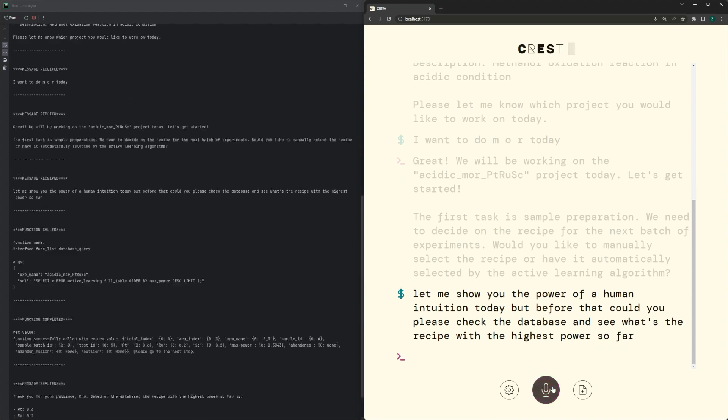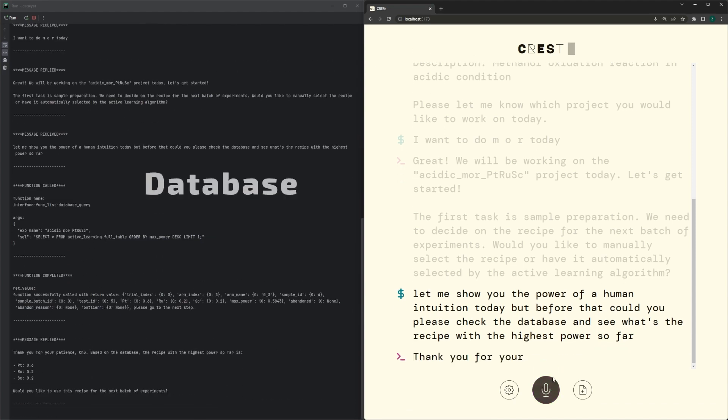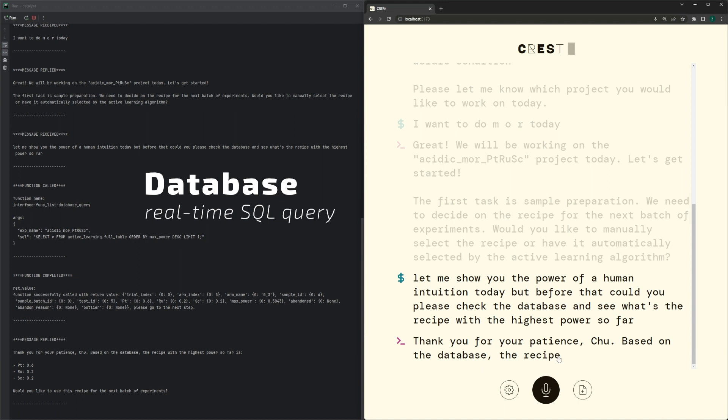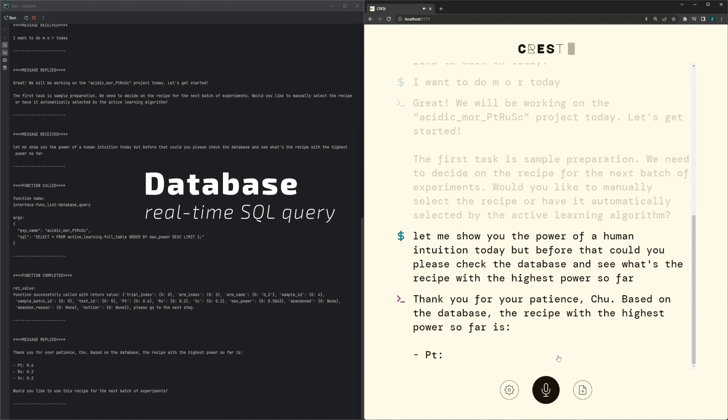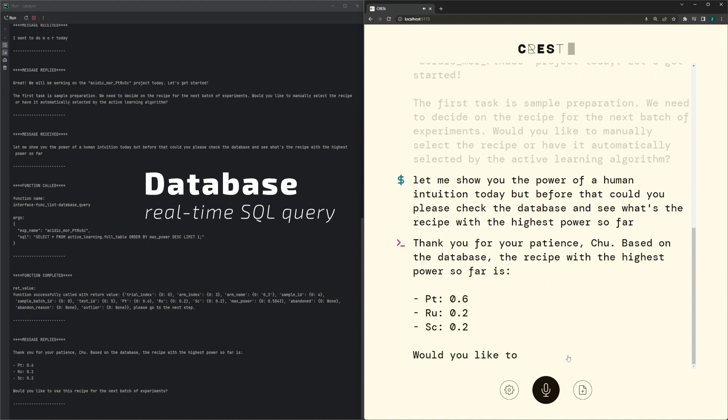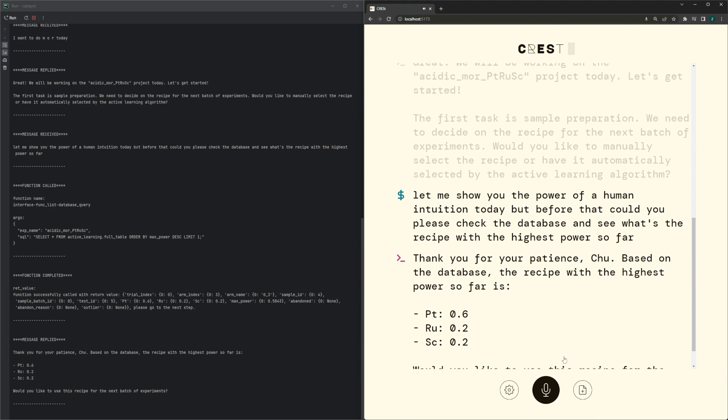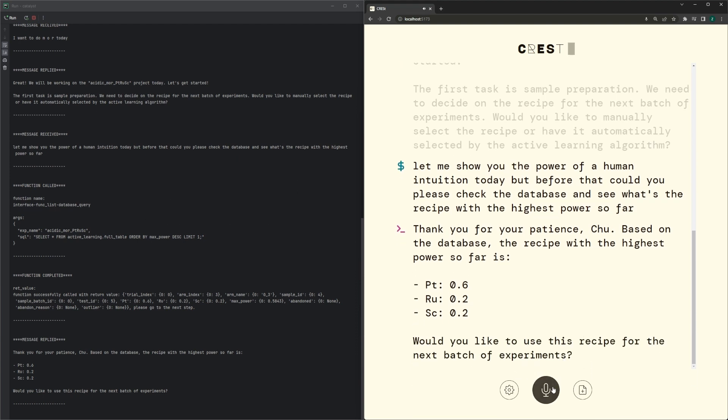Thank you for your patience. Based on the database, the recipe with the highest power so far is Platinum 0.6, Ruthenium 0.2, Scandium 0.2. Would you like to use this recipe for the next batch of experiments?